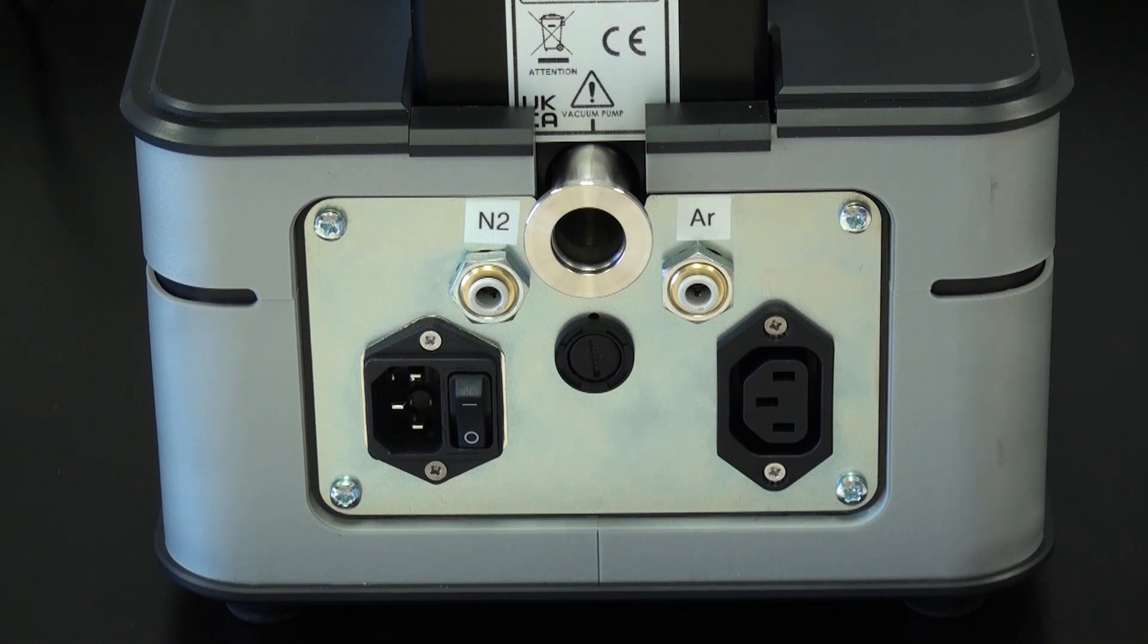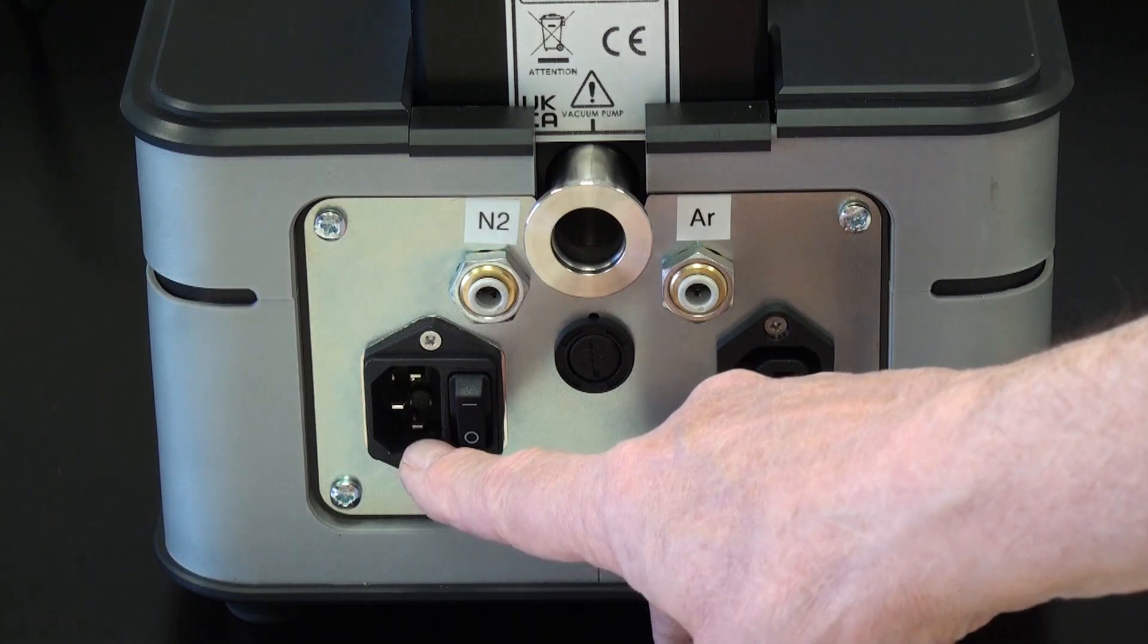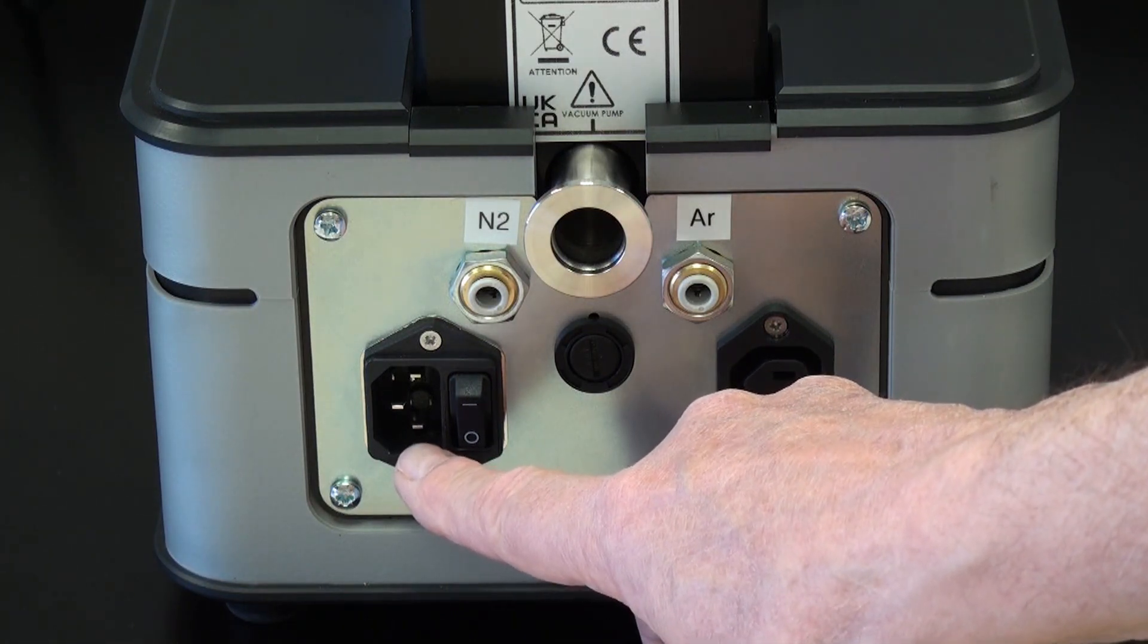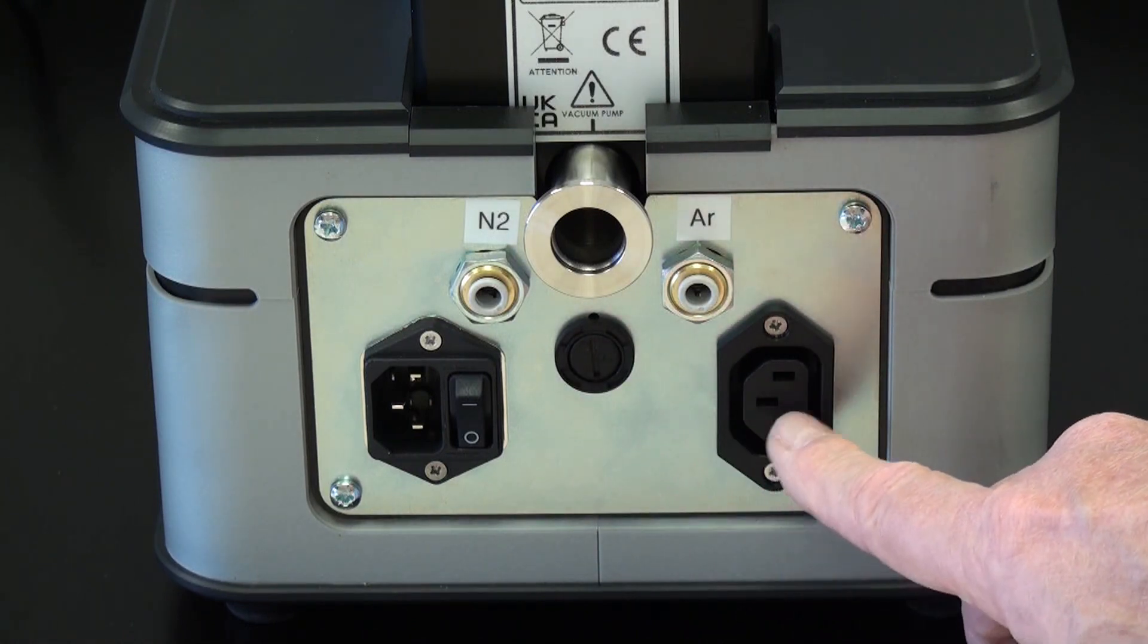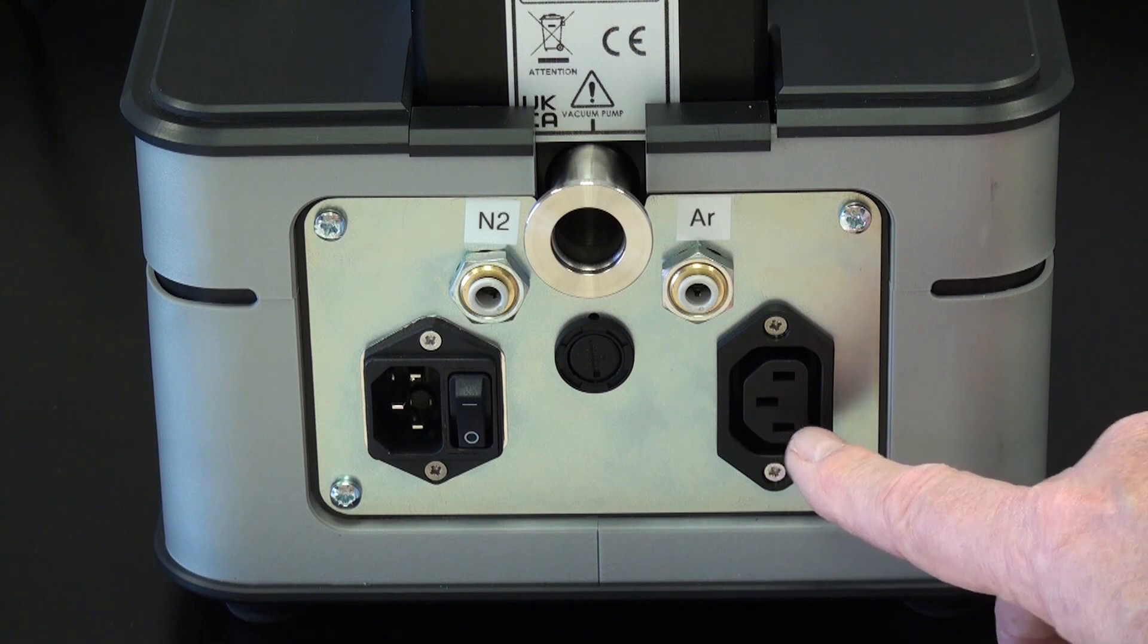You can also vent the system with argon gas if you wish, if this is more convenient where you only have one gas bottle in the room next to the instrument. You get the fittings in the accessory kit to do all that. Standard modular line cord for power, power switch, fuse, and this is the interface for the rotary pump.